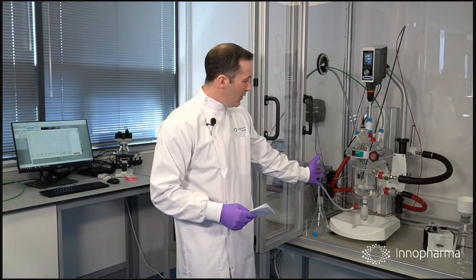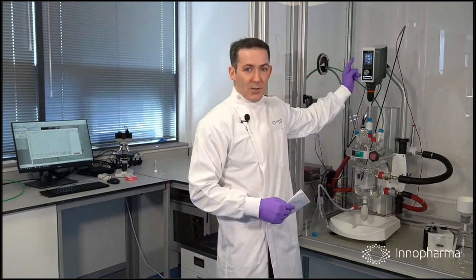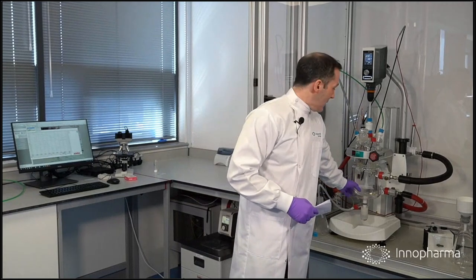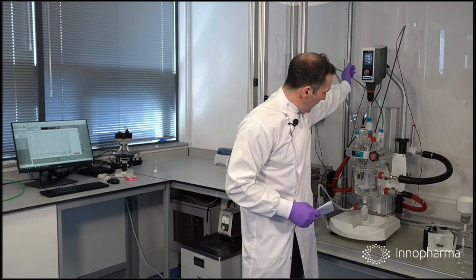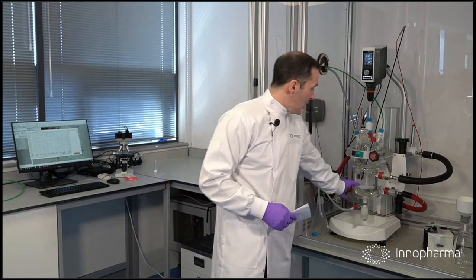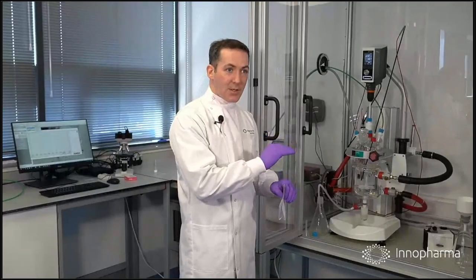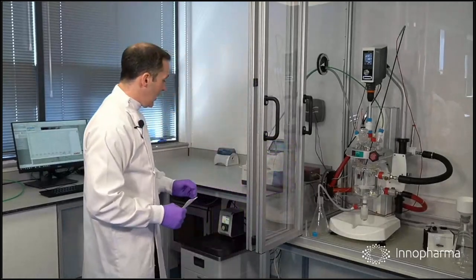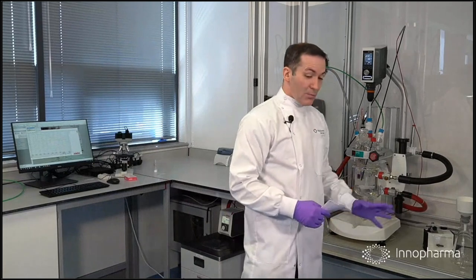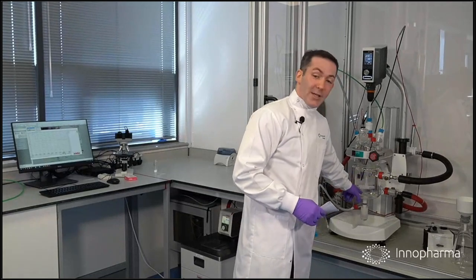For the time being, what we have here is a crystallization reaction vessel. There's a solution being stirred by an impeller. The impeller control is up here, and that controls how quickly it is being stirred. There is a jacket which keeps the reaction inside at a desired temperature. To control that, we have a chiller. The chiller is essentially just refrigeration or heating. It's responsible for delivering into the jacket.